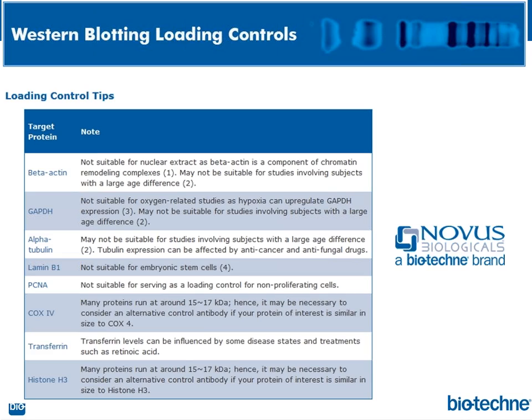And there's actually a map that you lay down on these arrays, like a key to tell you which spot equates to what target: phospho-STAT3, phospho-ERK, IL-6, TNF-alpha. And then you add, of course, a secondary, you form your sandwich, and then you get your chemiluminescent signal, which you then measure by pixel density. The spots are in duplicate, and you take the average pixel density, and then you can graph that. And then on the corners are positive controls. But really here, we're not talking about size fractionating and looking at things based on molecular weight.